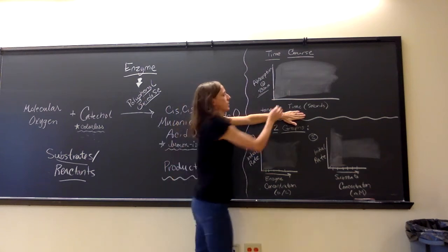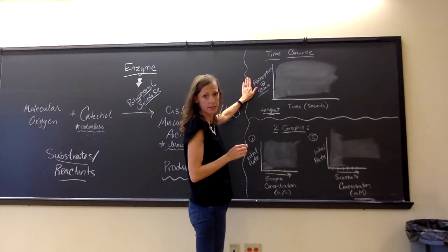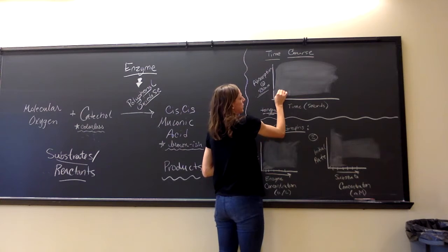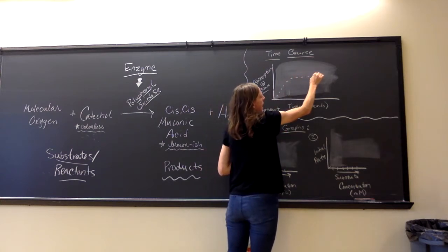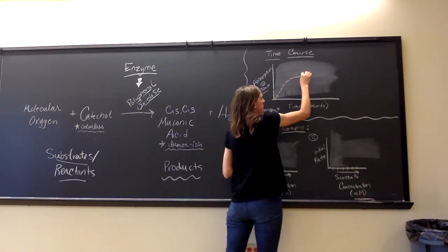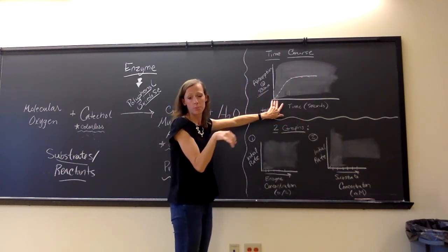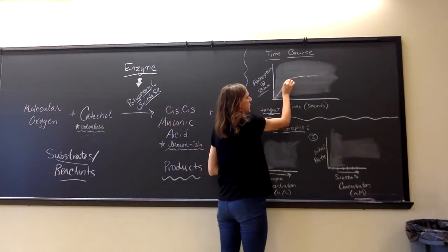So on our x-axis here, I've indicated time in seconds, how much absorption is taking place at each of those points in time, okay? So as you put the reaction in the spectrophotometer, you're going to get an absorbance reading every second, okay? And what you should see is then something that looks a lot like this, okay? Where at the beginning of the reaction, you first mix your ingredients and put it in the spectrophotometer, you're going to see that the rate of the reaction is quickest, okay? So you're going to see a pretty nice peak, hopefully.